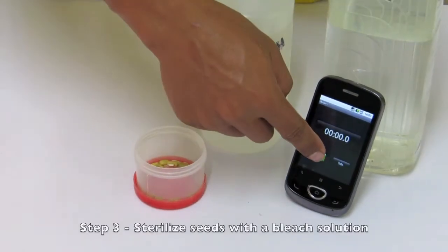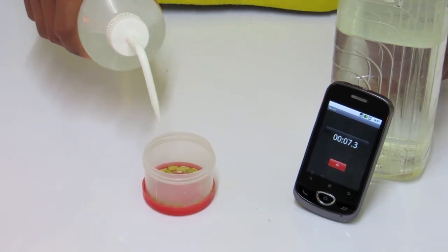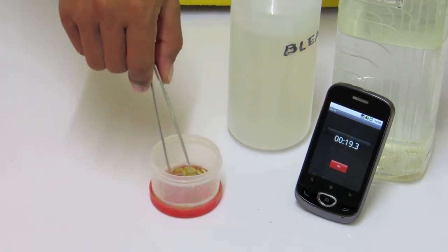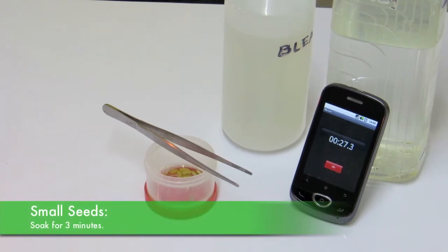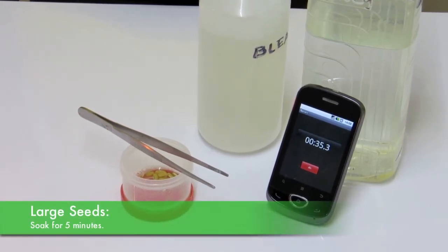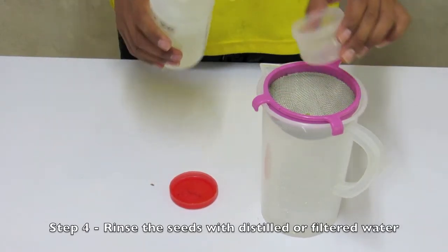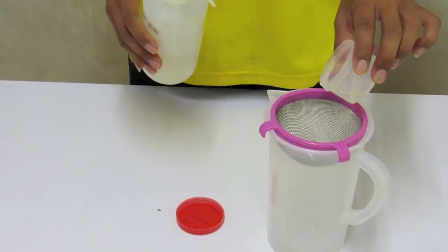Number three — each set of seeds will need to be surface sterilized individually before your germination test begins. Add enough of the 10% bleach solution to immerse a set of seeds completely. Swirl the contents gently to bring the seeds and solution into contact. Let the seeds soak for three to five minutes depending on the type of seed. Smaller seeds with softer coats should be soaked for three minutes, while larger seeds with thicker coats should be soaked for about five minutes. Number four — pour the bleach solution and seeds into a strainer or sieve, then rinse the seeds with at least six changes of distilled or filtered water before placing them in the petri dish.